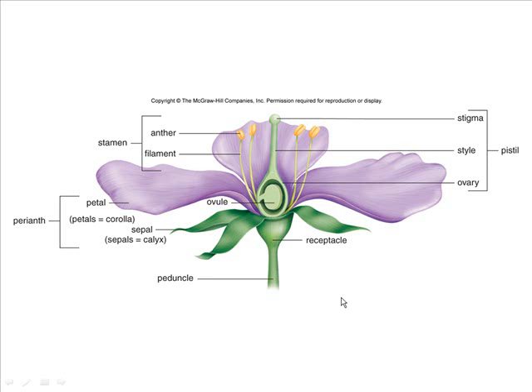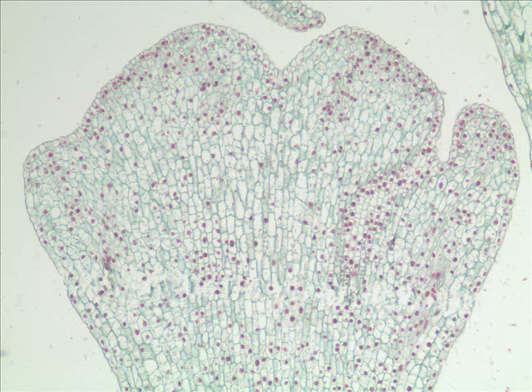So one thing you'll have to do on the lab test is recognize the various parts of a sliced and diced lily flower. And so first of all, a longitudinal view, longitudinal section. And so this is a little baby lily flower sliced from top to bottom the long way. And so what do we have here?